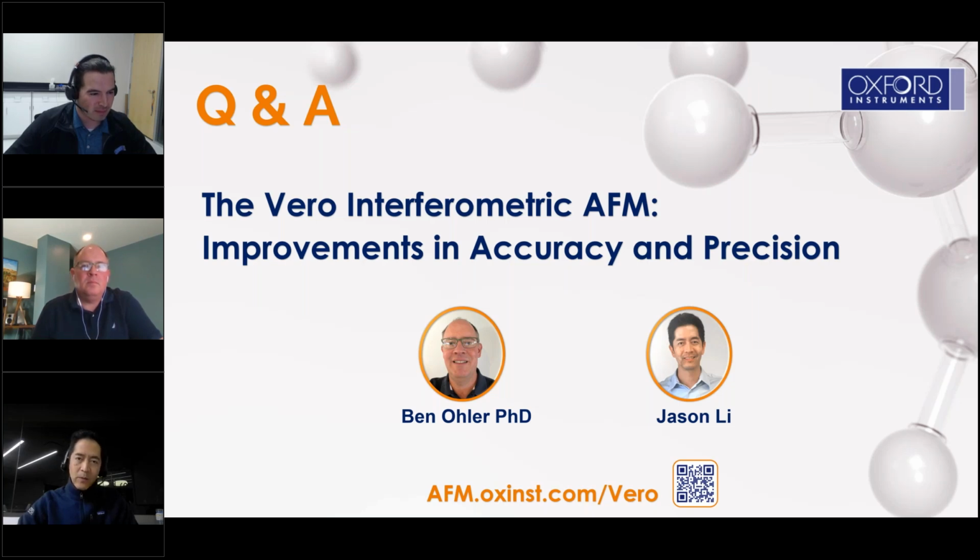And the QPDI spot, it sort of depends on what mode you're doing, but for these PFM measurements where you really care about the accurate tip displacement, we typically place the spot directly over the cantilever tip itself, which is why we prefer cantilevers with a tip set back.